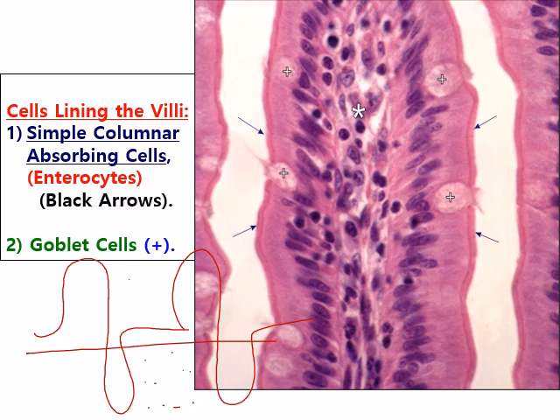Here is a villus. From where do you know that this is a villus? It does not contain anything between. Villi are lined with simple columnar absorptive cells containing microvilli and goblet cells. And this is a connective tissue corium.